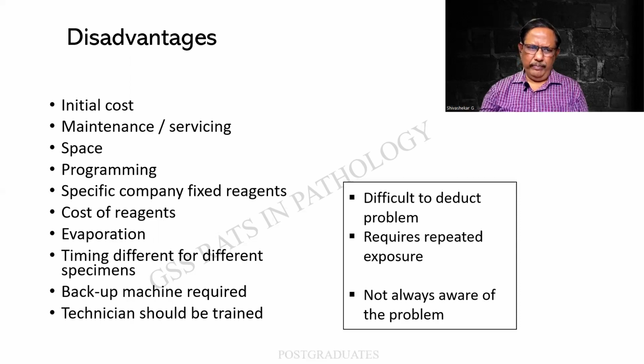penalty for it. A backup machine will definitely be required because of any technical problem. If this machine is going to get shut down, you cannot stop the histoprocessing. We cannot ask them to stop the surgeries in the theater. Everything will be continuing. Therefore, a backup machine is required. And again, the same story of space, cost, etc. And the technicians will be well trained to handle such things.